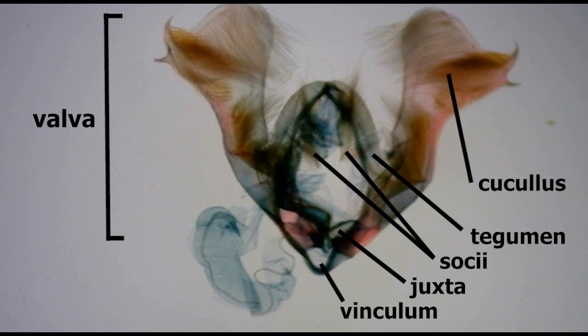If you want, the genitalia can be placed in a shallow well microstrip slide with ethanol and covered with a glass coverslip to be pressed flat or for photography. After this is done, the stained genitalia can be returned to a glycerol filled capsule pinned beneath the specimen.